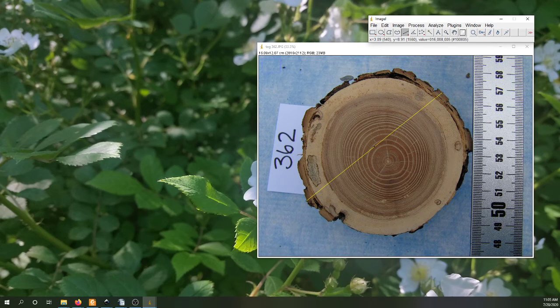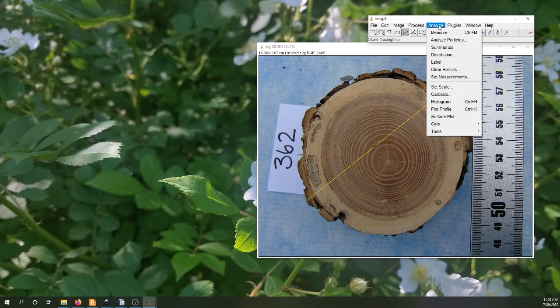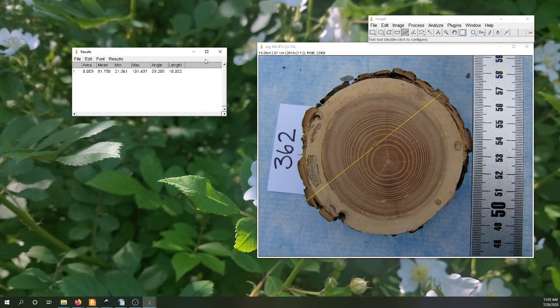And that's really nice because you can see all of your measurements. So both measure and the region of interest are also available by clicking through this. So you can click Analyze, go down to Measure, and that'll give you the measurements I just showed you.